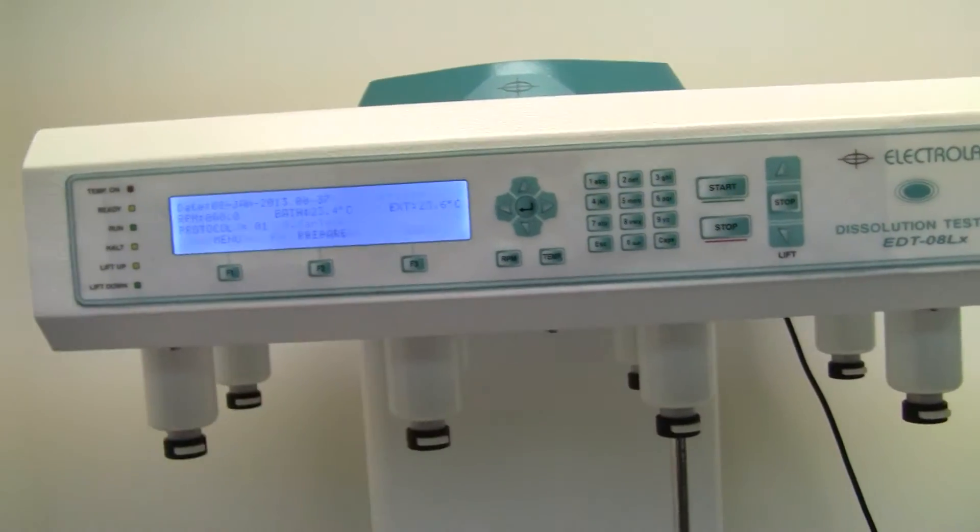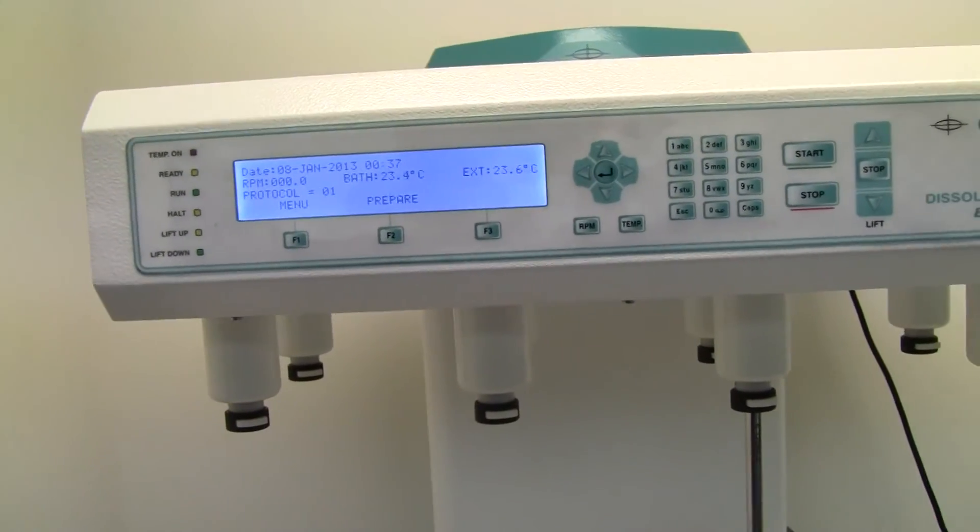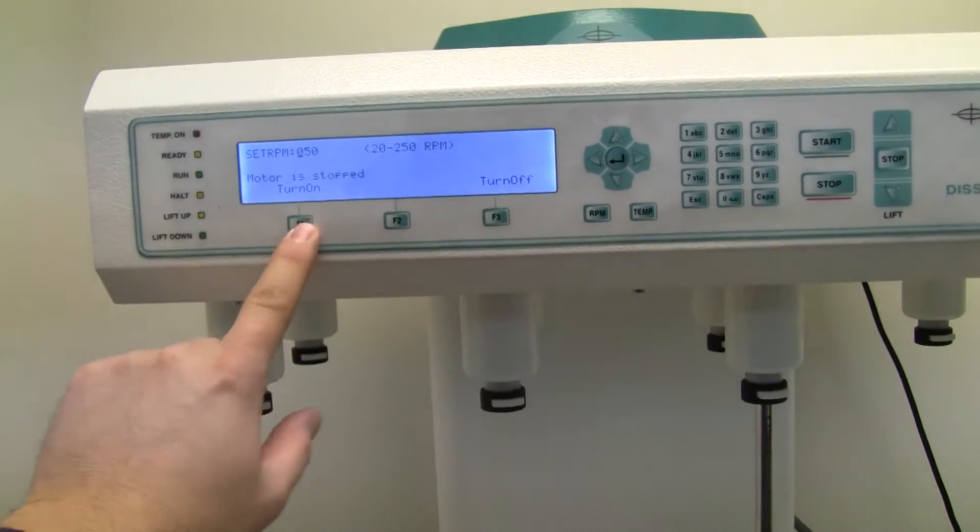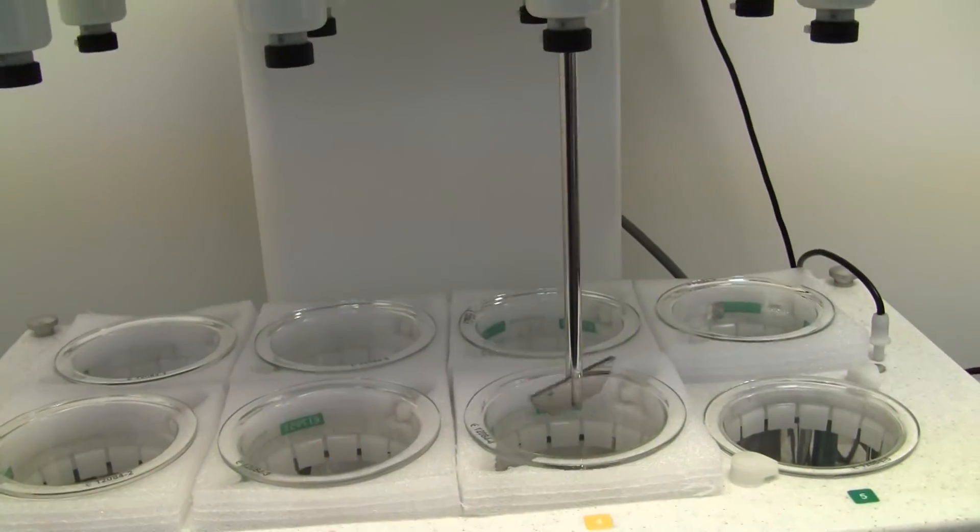Membrane keypad interface, very nice. Very quiet machine.